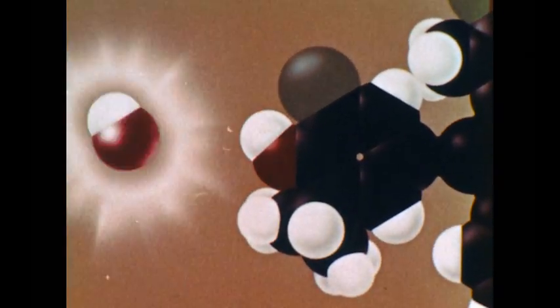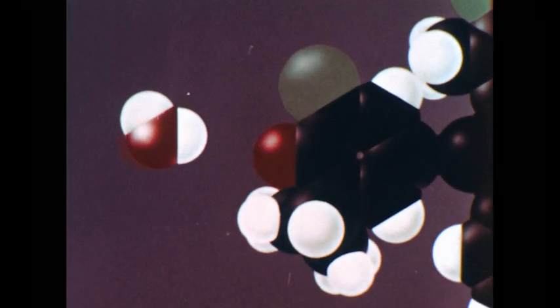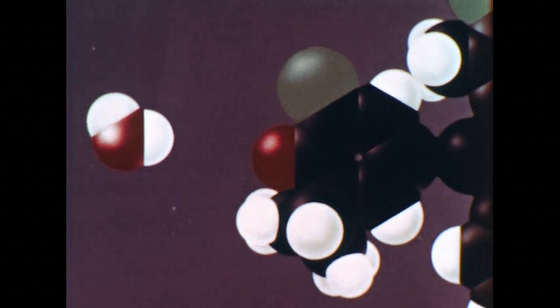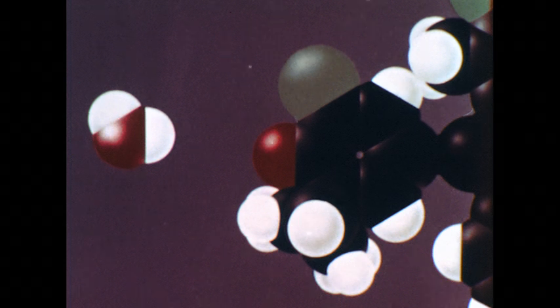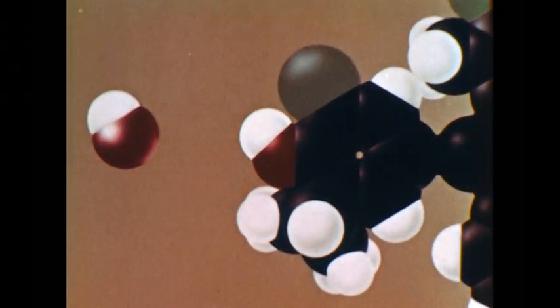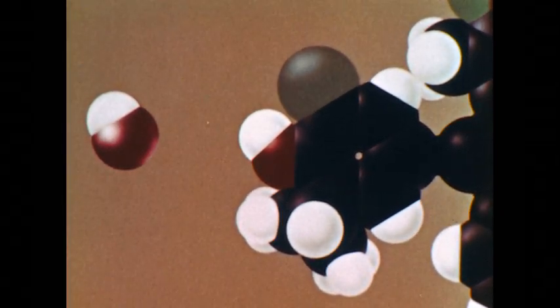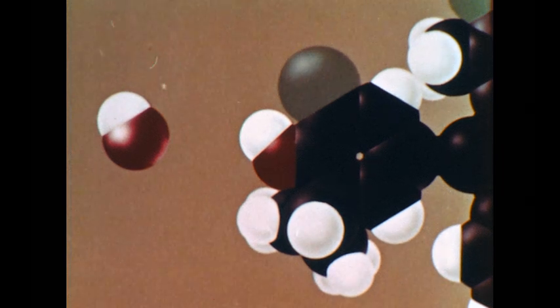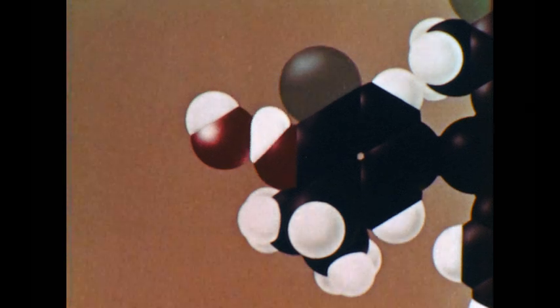This proton would be missing in the blue form. Addition of a base, such as hydroxide ion, allows the yellow substance to donate this proton to form water and the blue substance. Conversely, acceptance of a proton by the blue substance gives the yellow one. Indicators such as bromothymol blue can undergo acid-base reactions, changing color as they donate and accept protons.